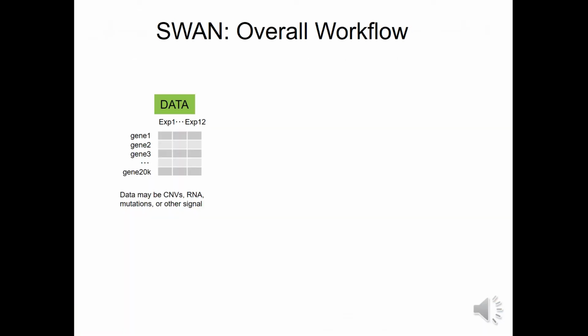The overall workflow is to start with your data with samples in columns and genes in rows of a simple spreadsheet. This can be any type of numeric data. You may have controls or experimentals or just experimentals alone. You then input this into the data groomer, and this will help transform gene identifiers into gene symbols. It will also normalize data to be appropriate for SWAN.